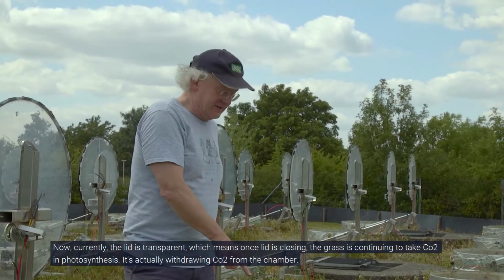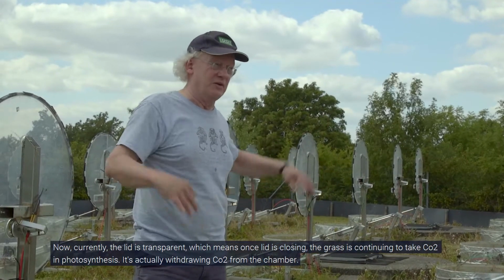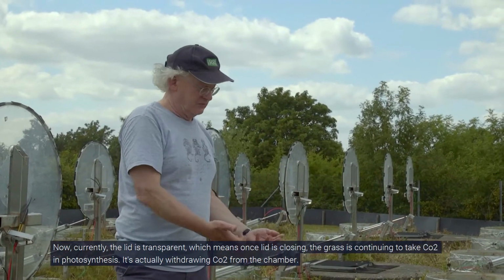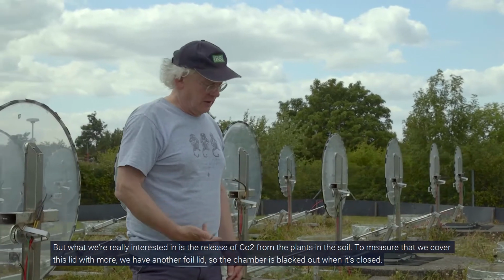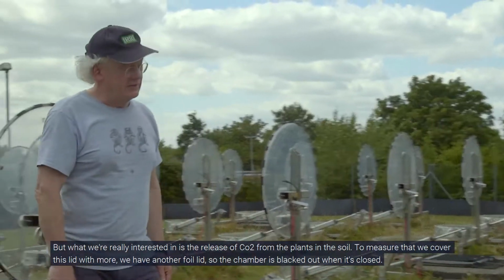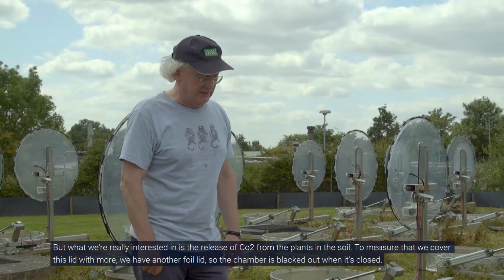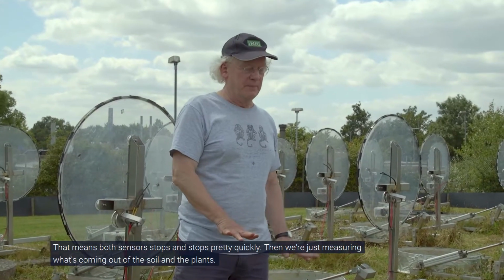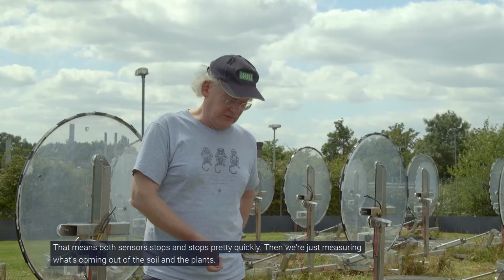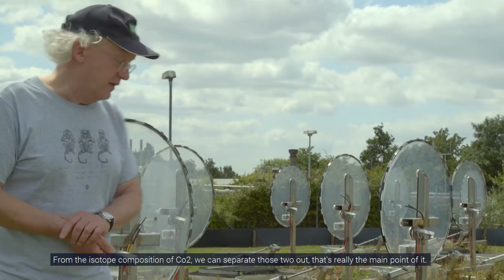Now, currently the lid is transparent, which means whilst the lid is closing, the grass is continuing to fix CO2 in photosynthesis. So it's actually withdrawing CO2 from the chamber. But what we're really interested in is the release of CO2 from the plants and the soil. So to measure that, we cover this lid with another foil lid so that the chamber is blacked out when it's closed. That means photosynthesis stops, and it stops pretty quickly. And then we're just measuring what's coming out of the soil and the plants. And from the isotope composition of the CO2, as I was saying, we can separate those two out. So that's really the main point of it.